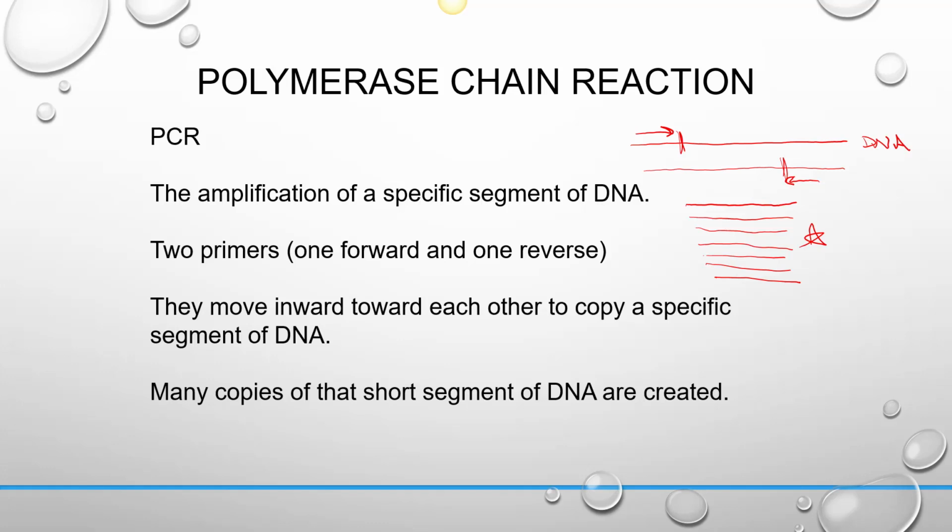So some applications of this. Let's say we have the mecA gene for methicillin resistance for Staphylococcus aureus. If we get the patient's bacterial DNA isolated, we put these primers on here that will stick to and recognize flanking regions of this mecA gene. It'll make tons and tons of copies only if it's present. So if you run this out on a gel and there's nothing there, then the patient does not have MRSA. But if you run it out on a gel and you do see a band in the particular size range, then the patient is positive for MRSA. So this is one application of PCR.